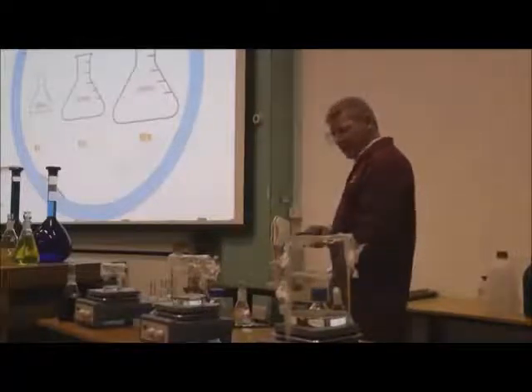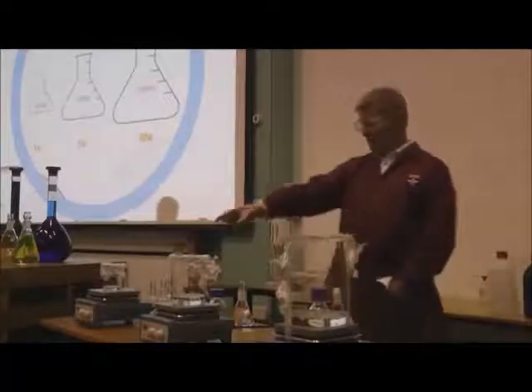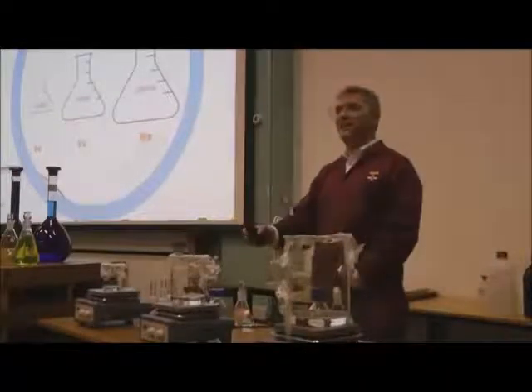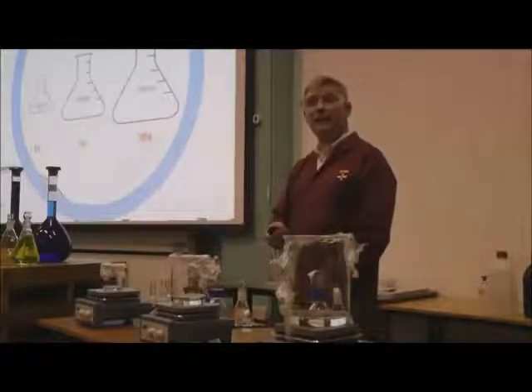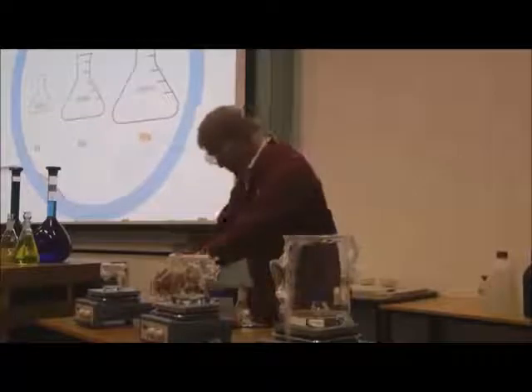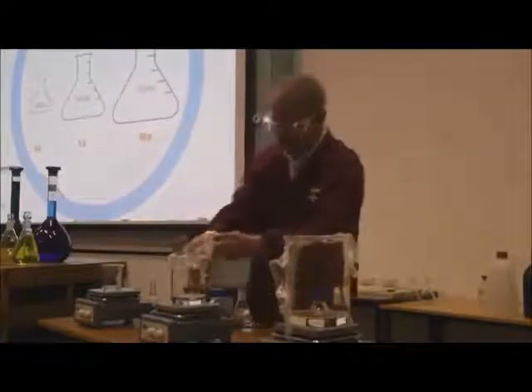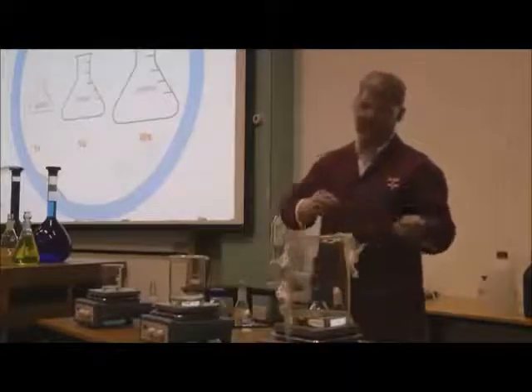So now I've got a general question. You may have noticed I've got 3 flasks here. Little one, medium-sized one, and large. And it's the same reaction. A plus B generates a colour, bit of C removes the colour until all C has been used up. This one, I'm going to prepare, better take the cling film off. There's one reagent I have to add myself, but I would like 3 volunteers to help with this.